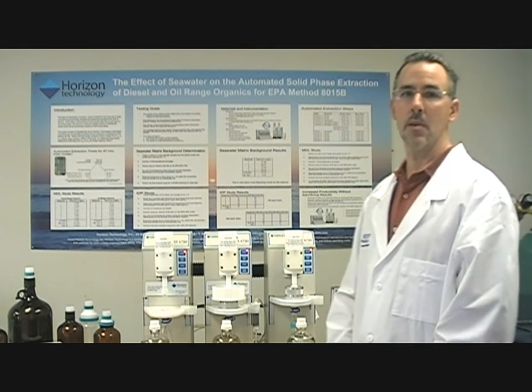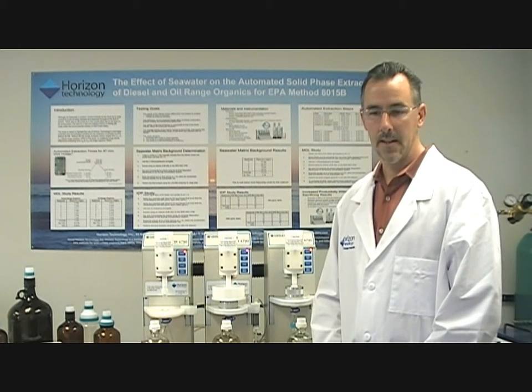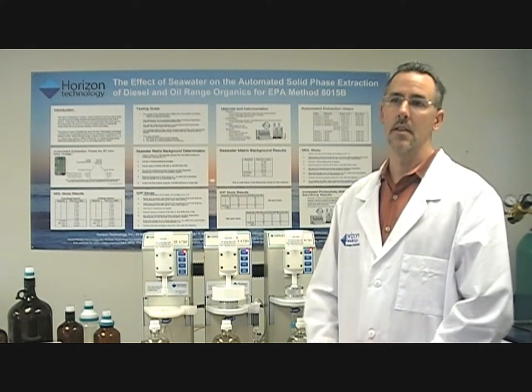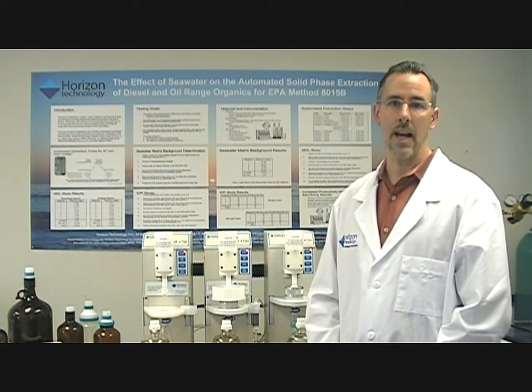Hi, my name is Mark Hamill, I'm the Director of Marketing here at Horizon Technology, and today we're going to talk about some unique solutions to sample prep for EPA Method 8270. This method is a complex method performed by most environmental labs.